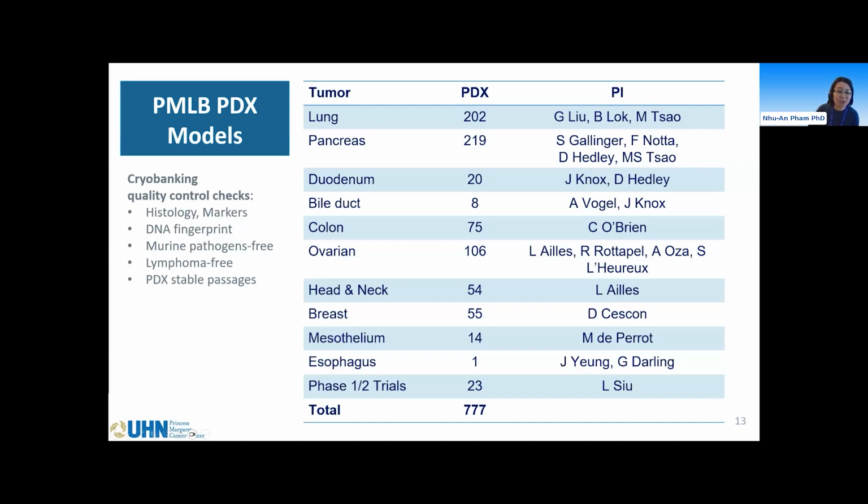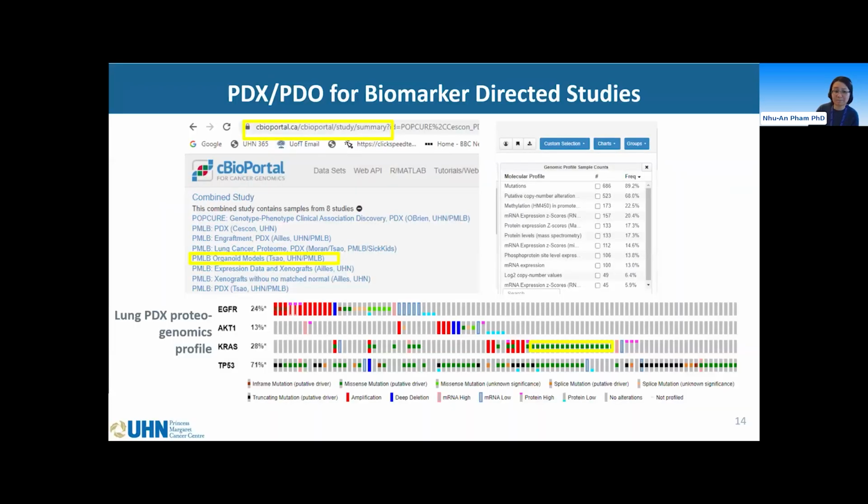Together with this tissue inventory, I also like to highlight the data inventory aspect, which is blooming for both Nikki and myself, and we don't have enough support in this, so we're still learning. Which includes the minimal essential clinical information and also the molecular profiles.